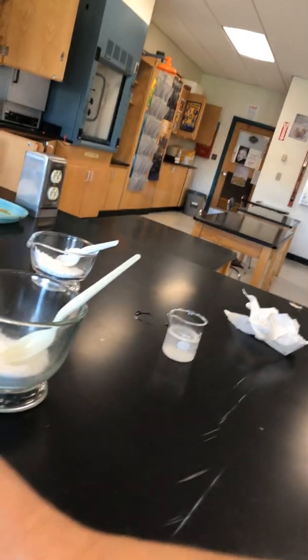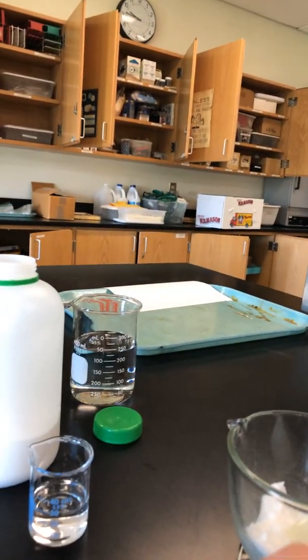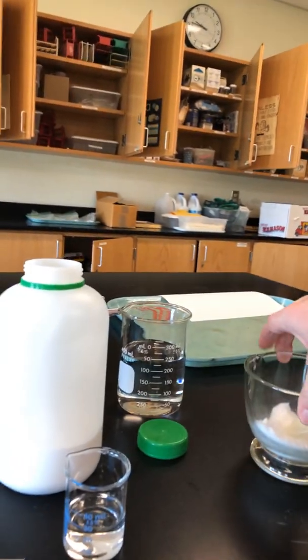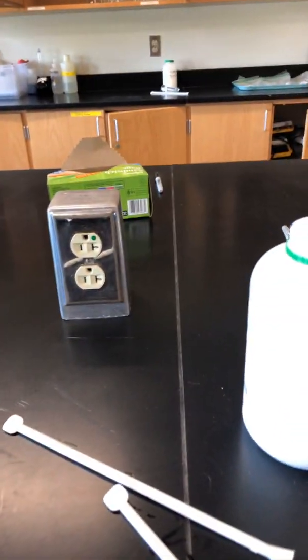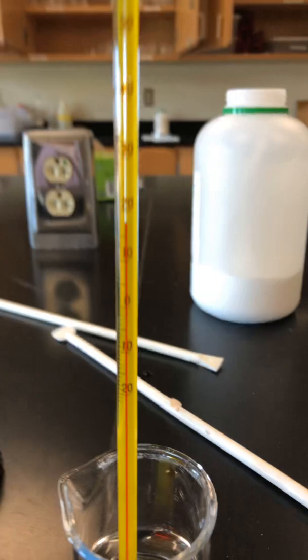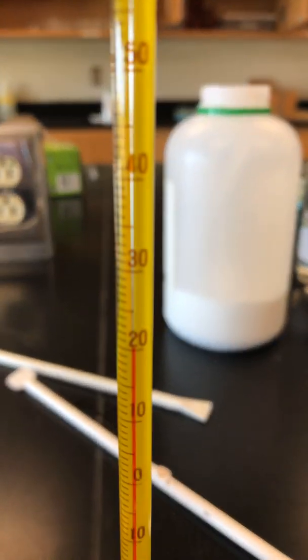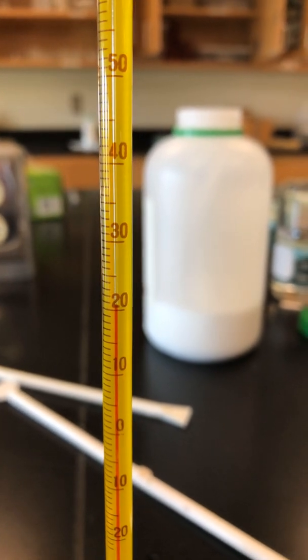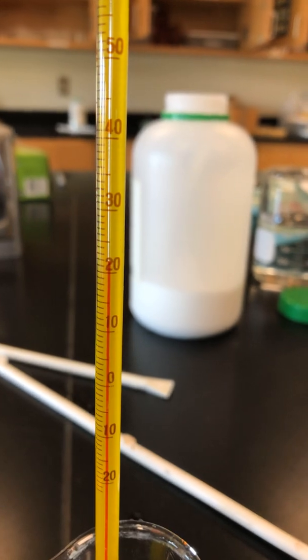Now I'm going to prep for our third and final salt. Okay, so fresh beaker of water. Lower the thermometer in, and we need to give the thermometer a minute to measure the initial temperature of this fresh water.